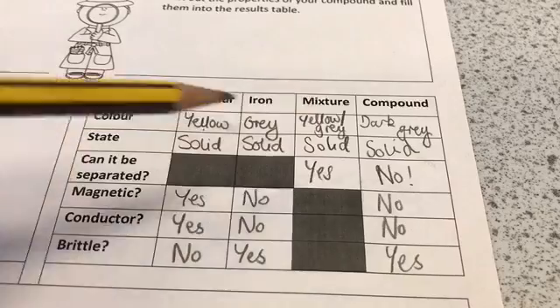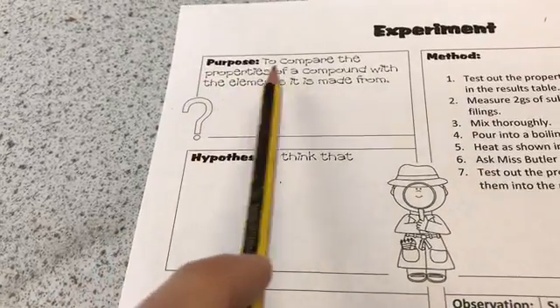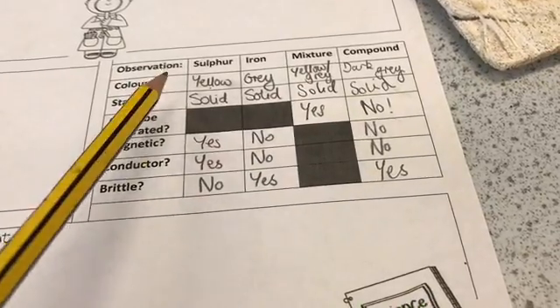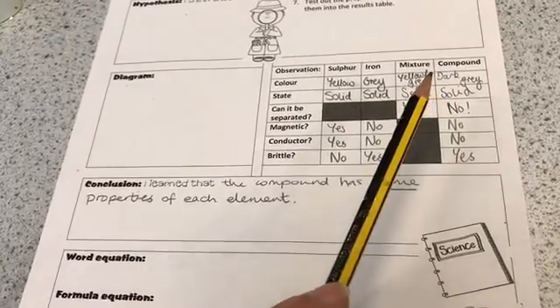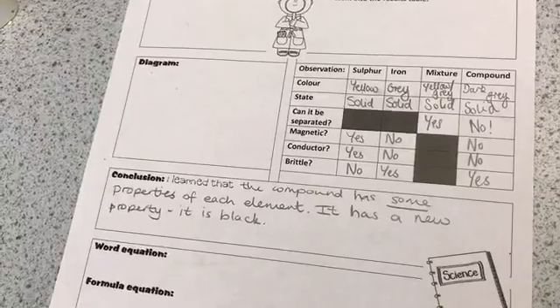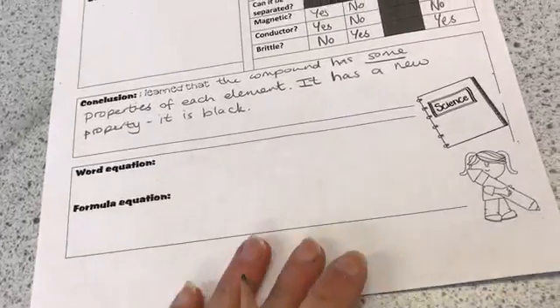We should now have filled in the whole table and we're on to the conclusion. Think about whether our compound has the properties of the elements it is made from. The compound has some properties of each element, and it also has one new property which is the dark grey or black colour. We can add to the conclusion to say it has a new property — it is black. Lastly, we're going to write the word equation and try the formula equation as well.